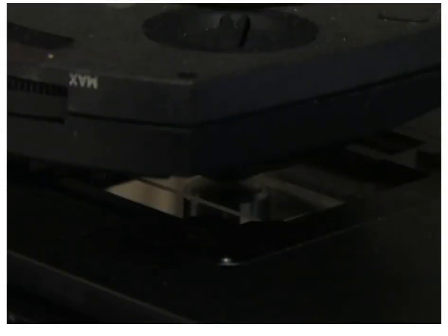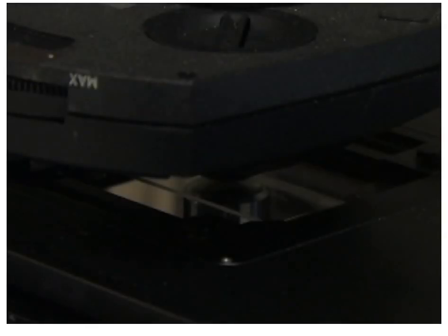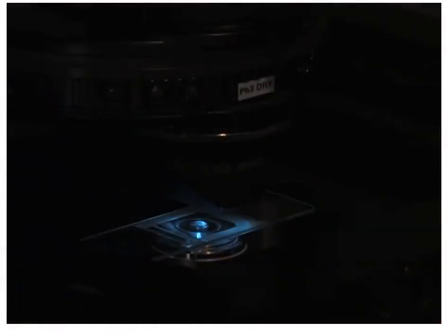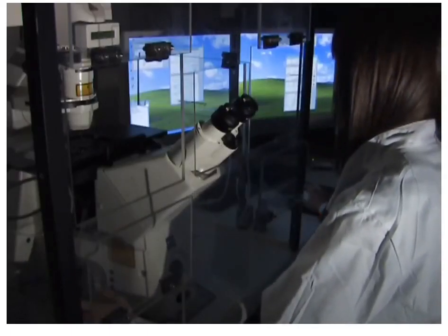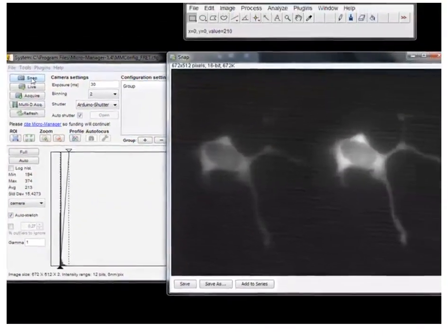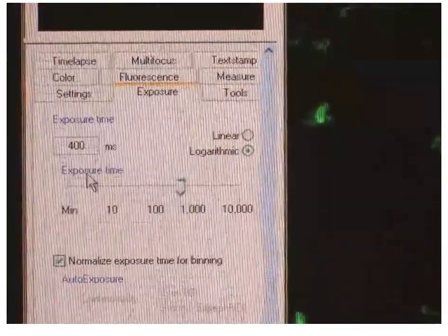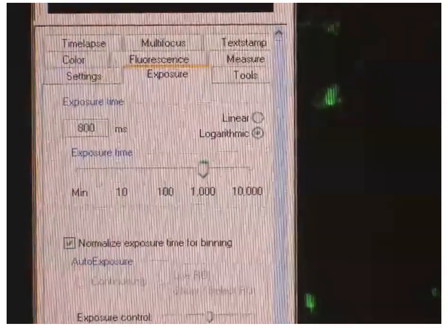Next, turn off the white light source as well as any unnecessary room lights to reduce background. Select the correct filter cube for the dye you are imaging and open the shutter to illuminate your sample. Finally, make fine focus adjustments and direct the output light to the imaging camera. You will likely need to make adjustments to the exposure time for each different fluorophore or fluorescent dye used. However, it is important to keep the exposure time constant when comparing features with the same dye on different samples.